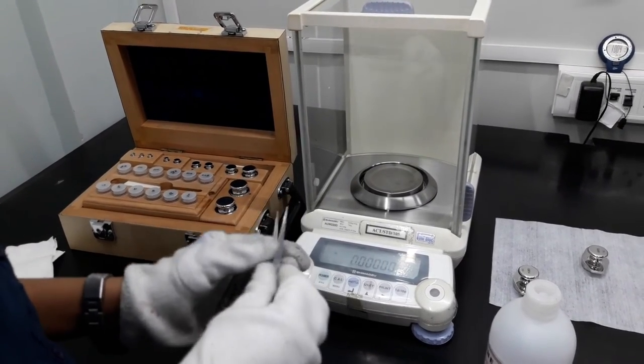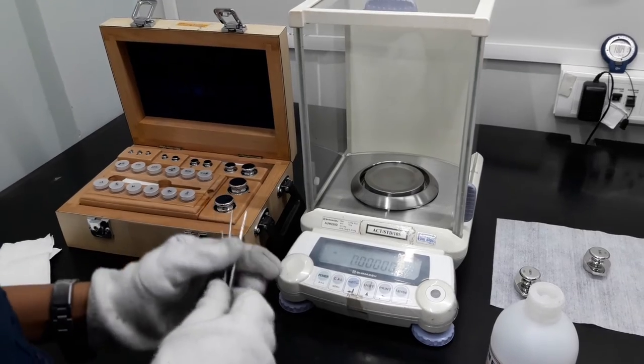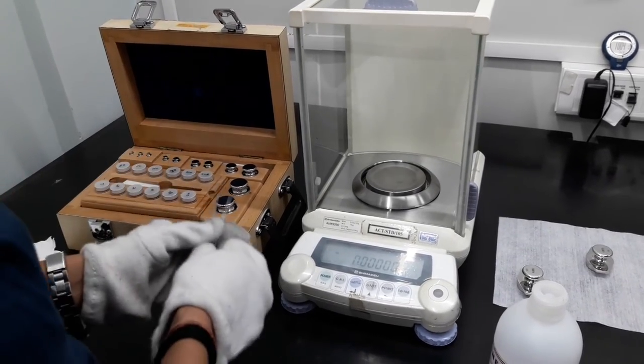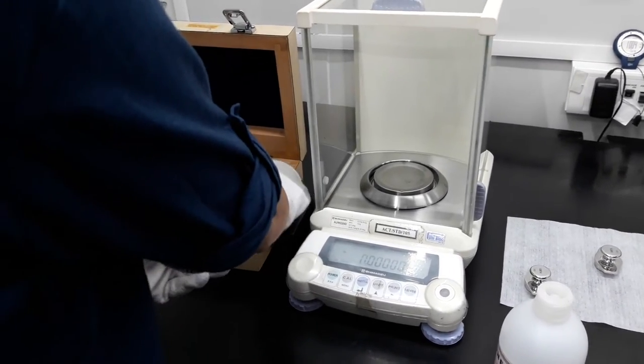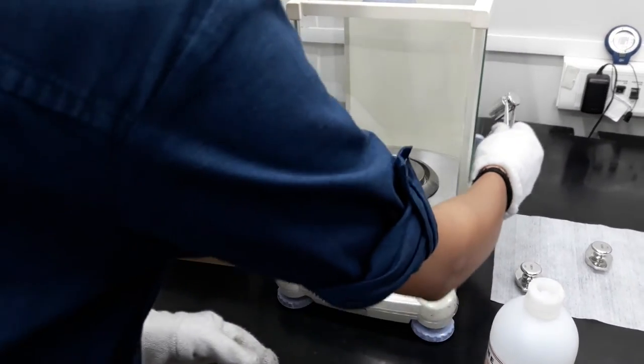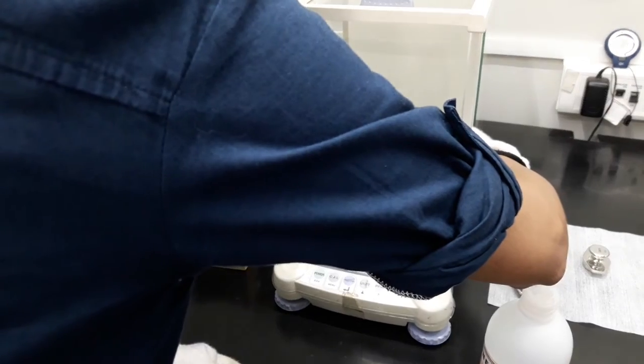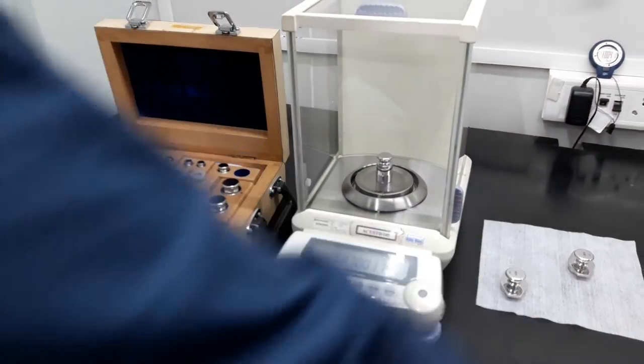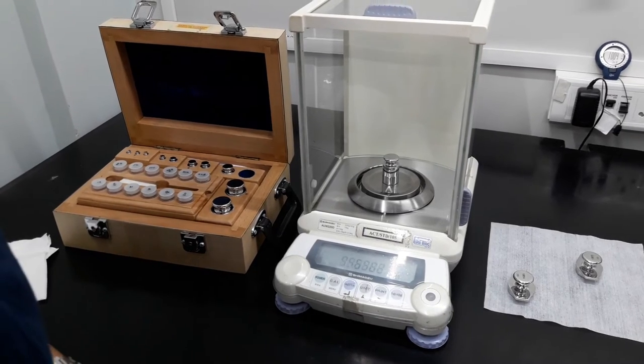First of all, as per ABBA method, take the reference weight and keep it on the pan of the weighing balance. Observe the reading and note it on CDS.